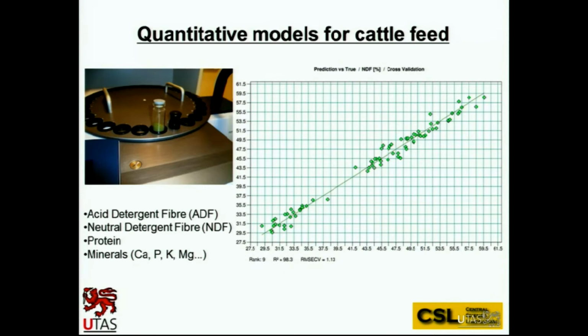And where it gets a little bit complicated is when you, for example, get regional effects, seasonal effects. So you might have a brilliant model that worked for 2012. Now you want to predict 2013 samples. You might get an issue. But all it means is you might have to include another 50 samples into our existing model and build what we call a more global model. And over the years, you actually overcome these seasonal effects, and you have a very robust global model.